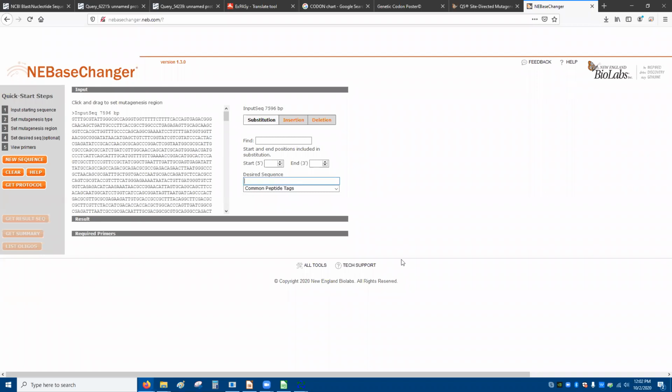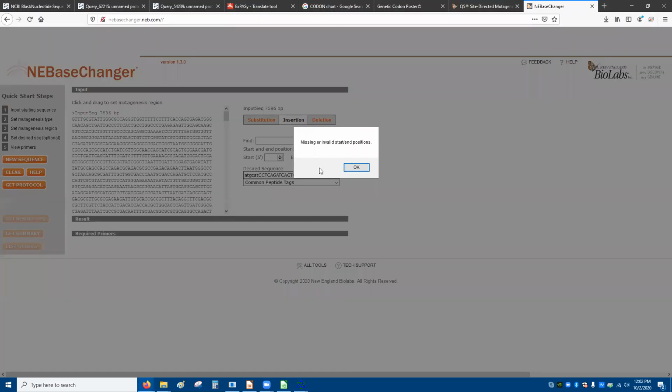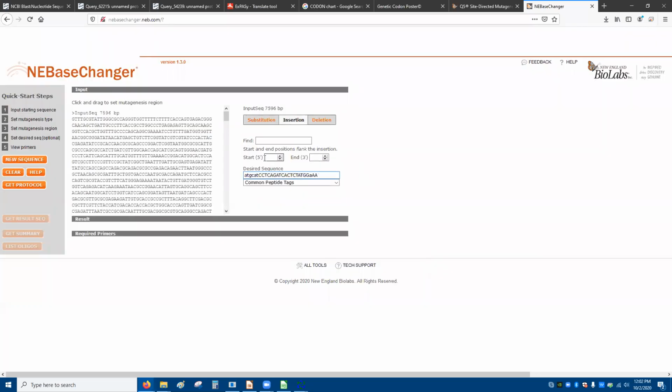Yeah, save it. Okay. We want insertion. And we want from here to here. 3438, 3466.